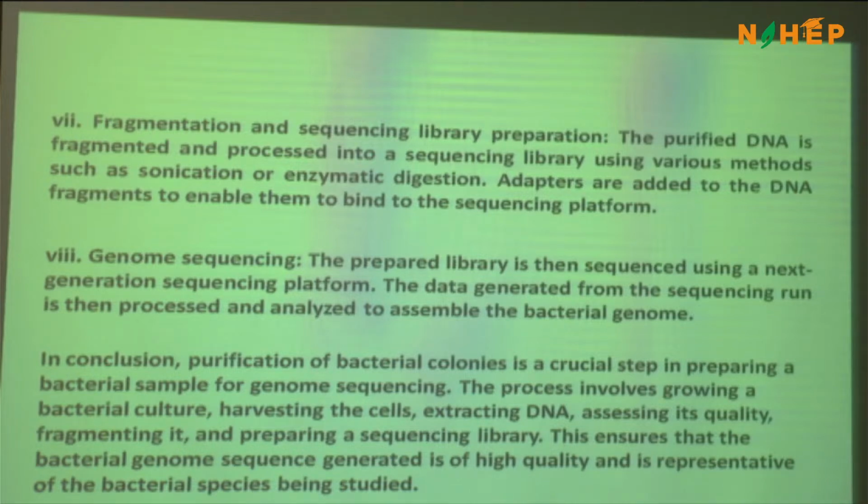So now this 300 ml, whatever you extracted, needs to be pelleted down by centrifugation, and the pellet is finally suspended in 1 ml, right? That 1 ml would carry most of the microbial cells you wanted to isolate, right?